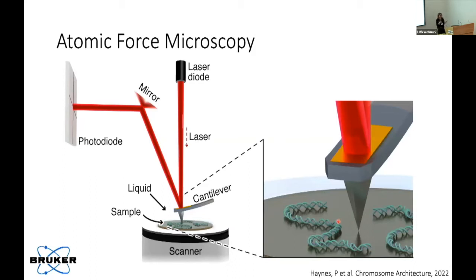And there's a bit of a caveat there that we have to stick everything down. And we don't like to talk about that very much, but it is a very essential part of what we do. And it's sort of important to put that out there up front. It's not just lying there, it is slightly blue tacked down. And when we use AFM, we're actually able to see the structure of DNA.